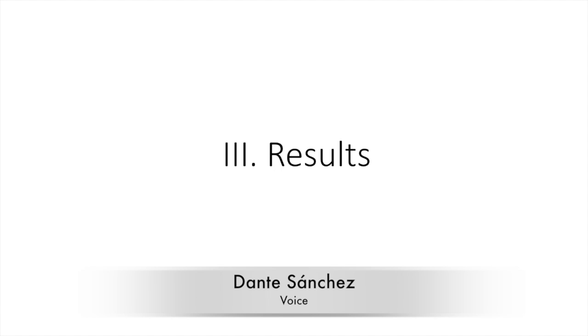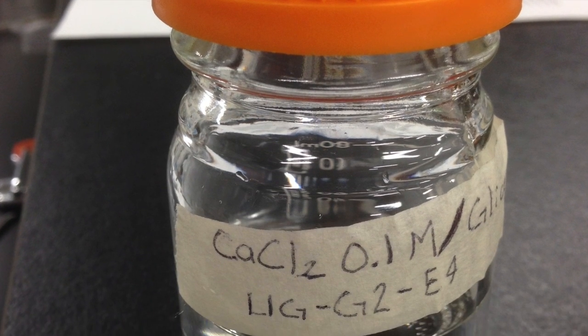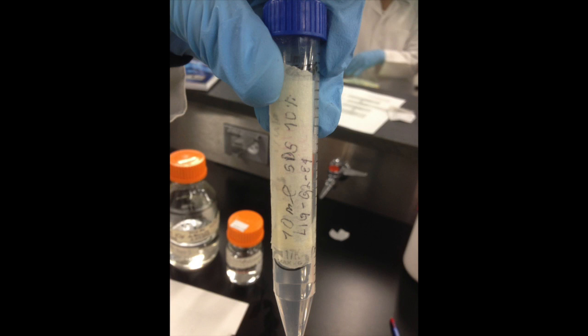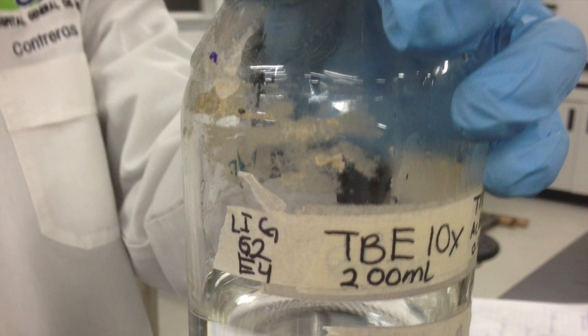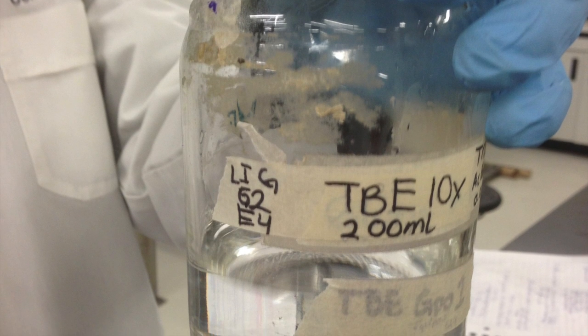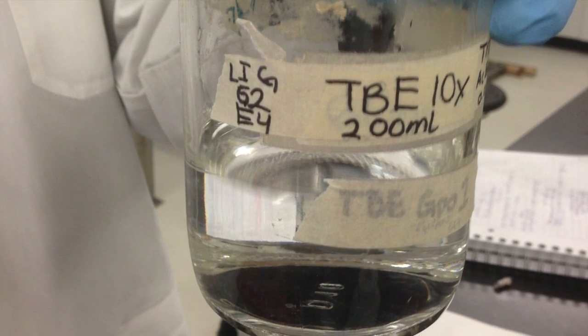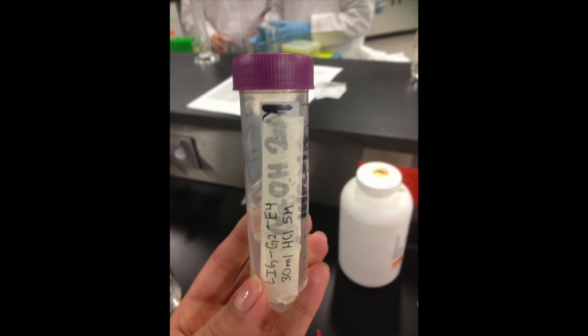As a result, we have 4 solutions. The first one is 50 milliliters of calcium chloride, 0.1 molar, and 15% glycerol. The second one is 10 milliliters at 10% of SDS. The third one is 200 milliliters of TBE 10X, prepared with Tris base 1 molar, boric acid 0.9 molar, and EDTA 0.01 molar. The fourth one is 30 milliliters of hydrochloric acid 5 molar.